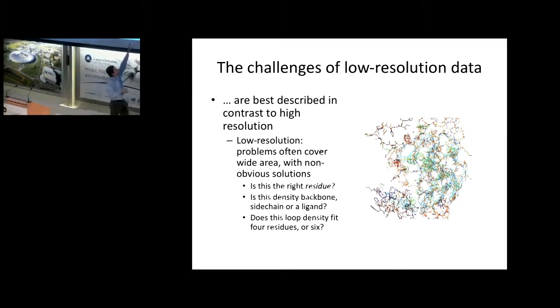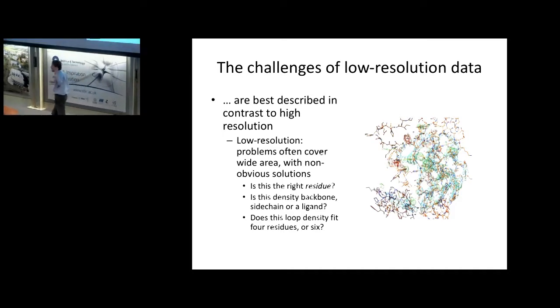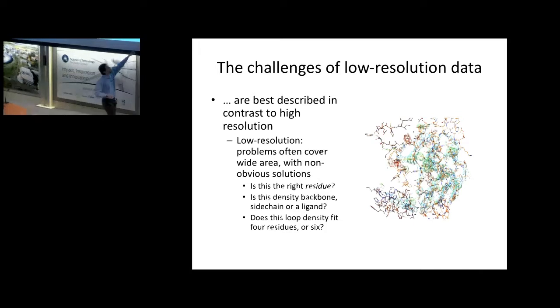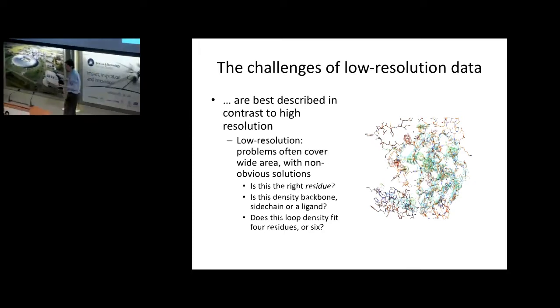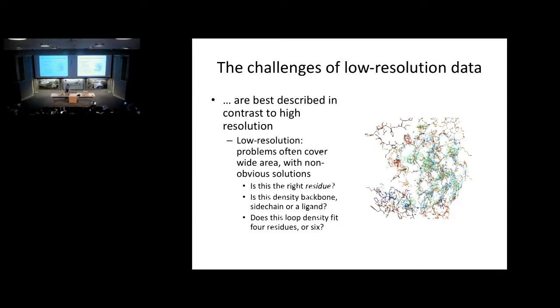It's a very complicated region because just up above there's a dimer interface, a biological dimer, but also a crystal interface. Down here there's not 1, not 2, but actually 3 non-specific crystal contacts all messing it up. And there was a fibronectin domain that at the time had no homology model, so it was all threaded by hand. And it's gone very, very wrong.